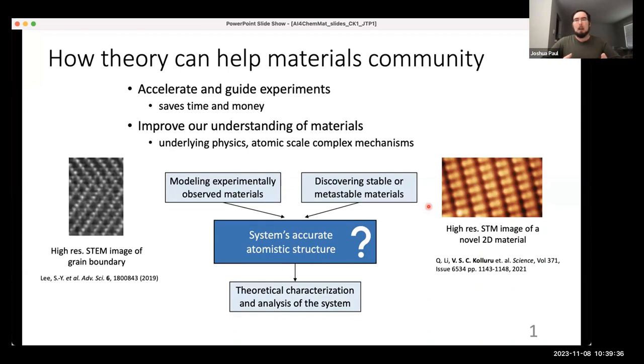In the case of STM images, what's being measured isn't atomic positions, it's the partial density of states of the system. And so what appear to be raised features can actually be physically lower in the system, and what can appear to be lowered parts of the image can actually be raised features physically. So there is nuance to analyzing these images that we can hopefully address.